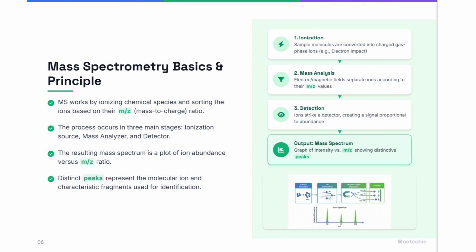Now let's shift our focus to a different but equally powerful technique: mass spectrometry basics and principle.